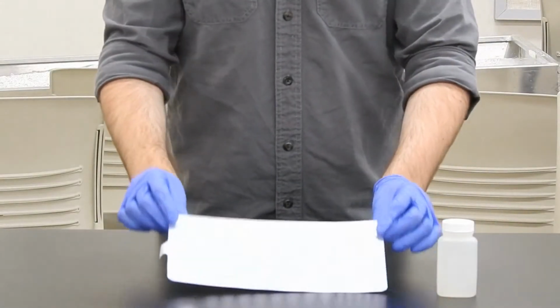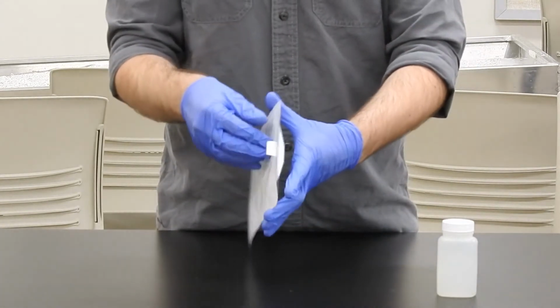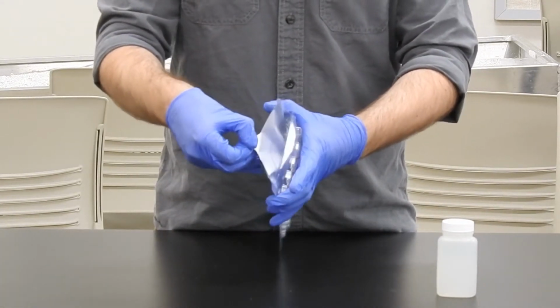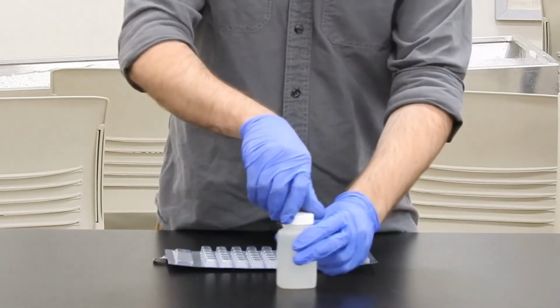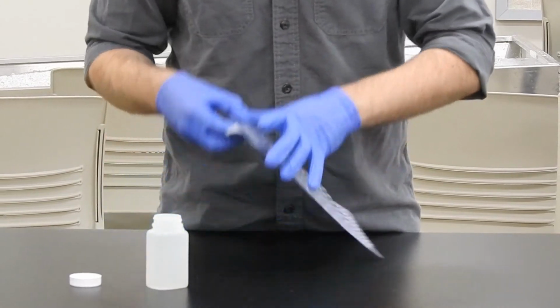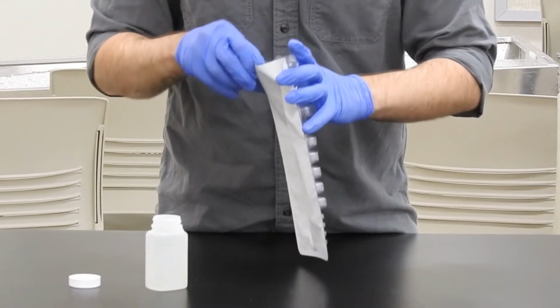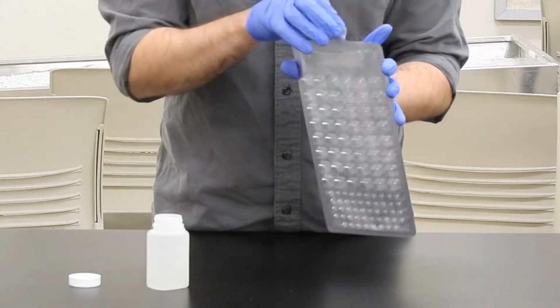So the next step, we'll use one of these quanti trays, which are basically just a plastic tray with a paper foil backing. They have all kinds of different cells in the plastic shape, and we're going to be using those to segment the water sample into those individual cells, which is important later for when we're trying to count the tray to determine how much bacteria is present.